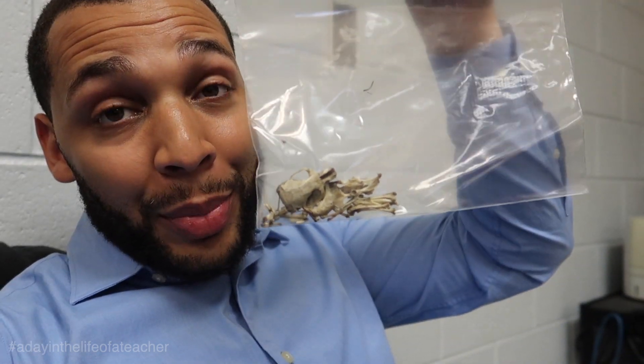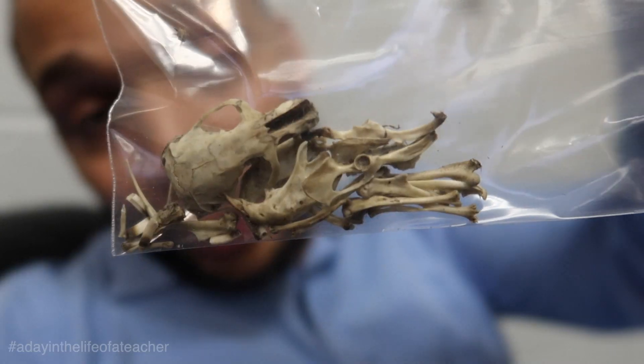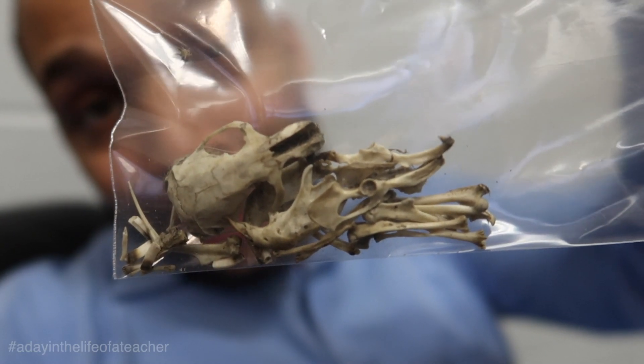Y'all, these bones are the biggest bones I've ever seen in my four years of doing this assignment. Whatever our owl ate that day, they had a big appetite.